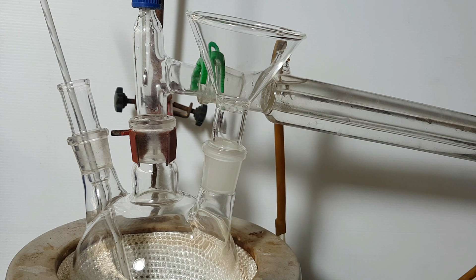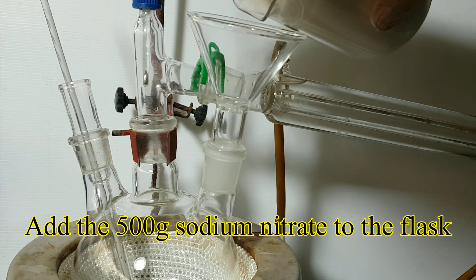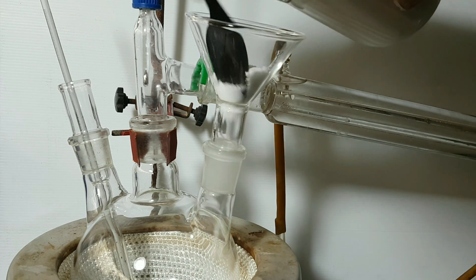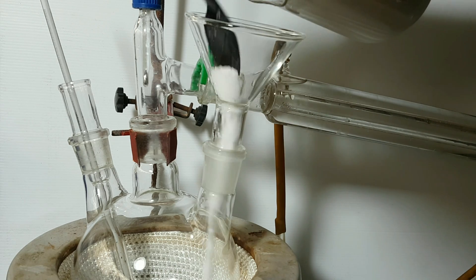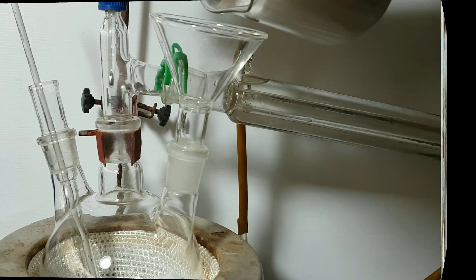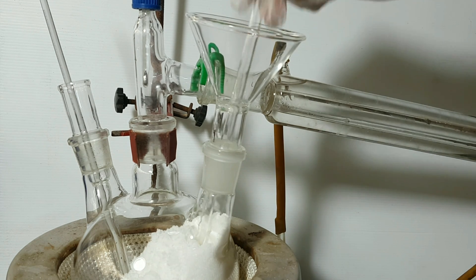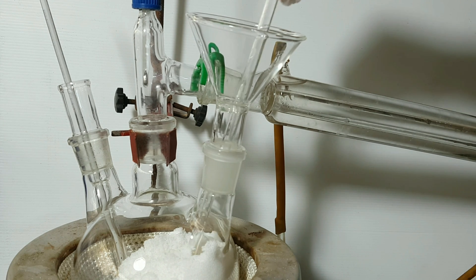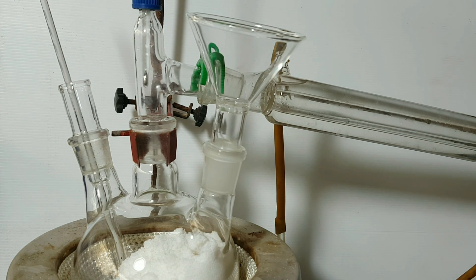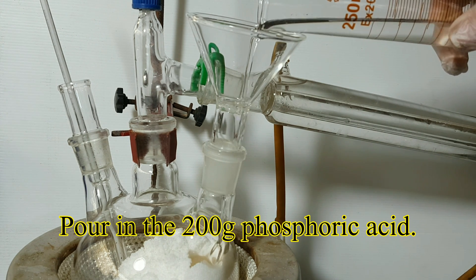Set up for simple distillation by using a one litre round bottom flask. Add the 500 grams of sodium nitrate to the flask, then pour in the 200 grams of phosphoric acid.